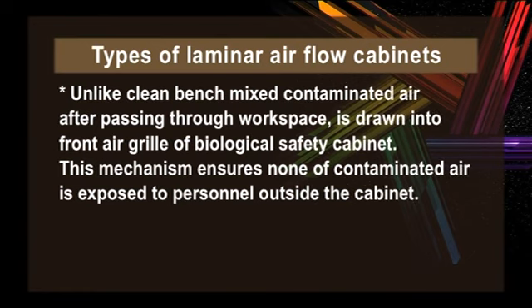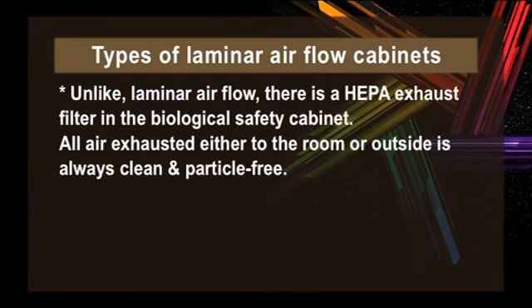Unlike a clean bench, mixed contaminated air after passing through the workspace is drawn into the front air grills of a biological safety cabinet. This mechanism ensures none of the contaminated air is exposed to personnel outside the cabinet. Unlike laminar airflow, there is a HEPA exhaust filter in the biological safety cabinet. All air exhausted either to the room or outside is always clean and particle free.